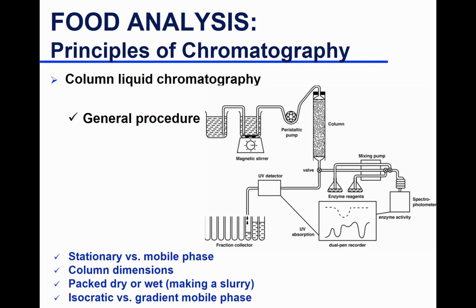We'll talk about them in the HPLC lecture. So it goes through a detector, and if it's a UV detector, that means your compound absorbs UV light. So you are either measuring absorption or emission of light, and then you get a signal. As the peak comes out or as your compound comes out, you see peaks, and that is a signal of absorption.